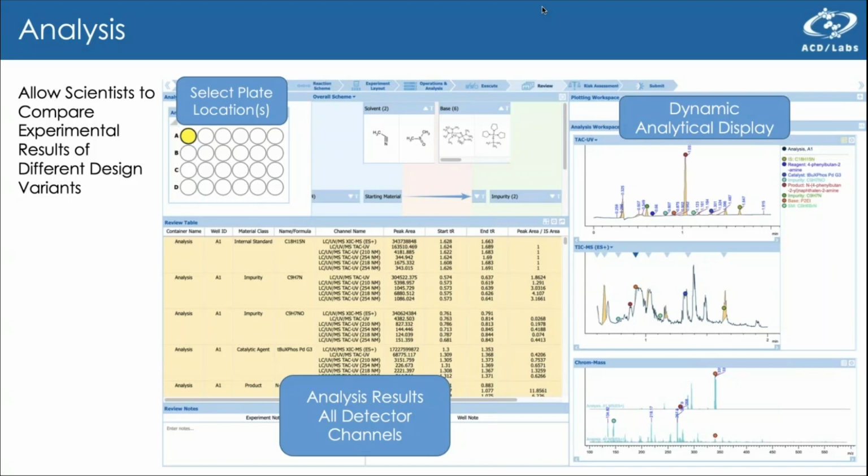There's also visual representations of things like detected peaks and the retention time, as indicated by the numbers above the peak. The shading on the peak itself represents the fact that a peak has been integrated. So depending on your baseline settings as well as your peak detection settings, you'll see whether a peak has been detected and integrated and how that integration's been performed.